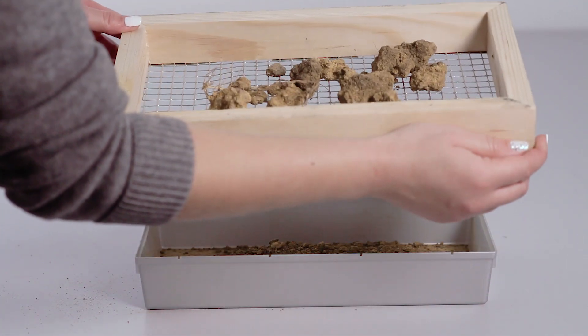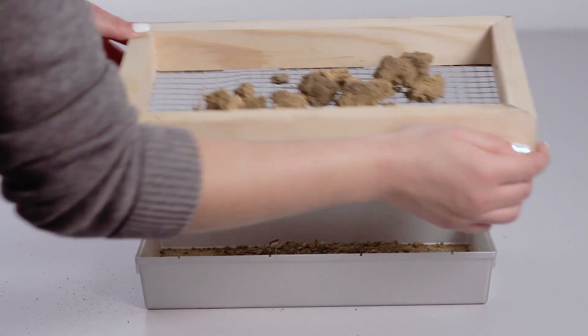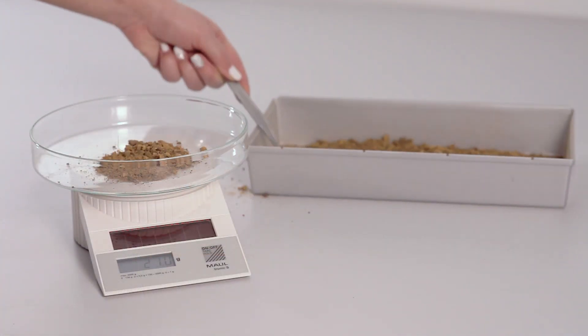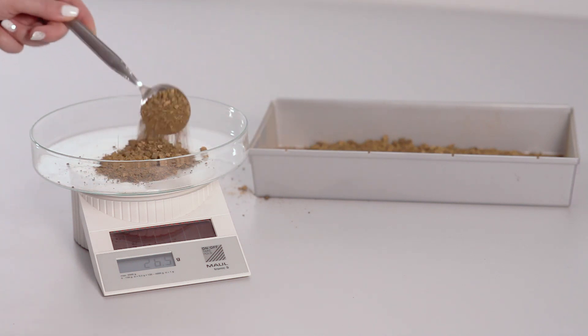Firstly, the collected soil or substrate should be homogenised using a sieve. If you are working with soil, 100g of the sample should be used for the extraction process.